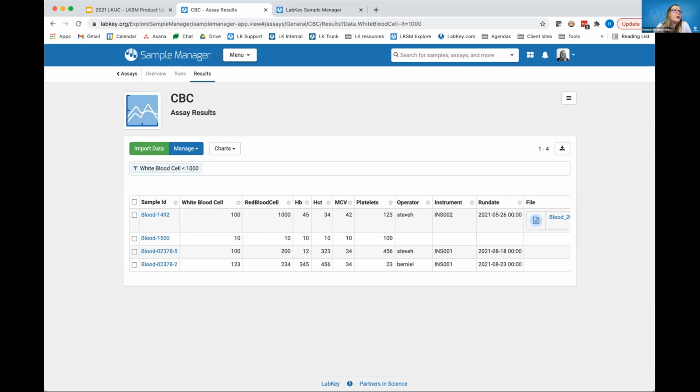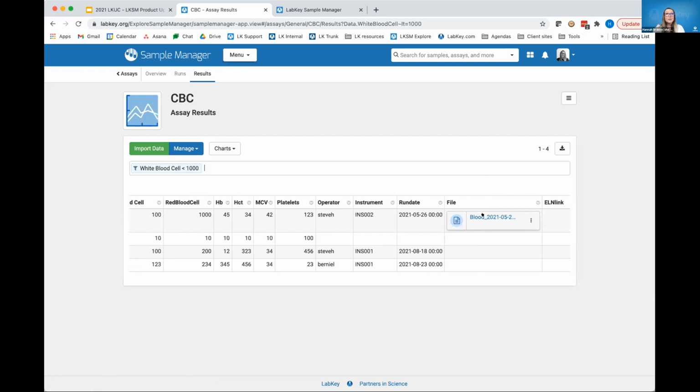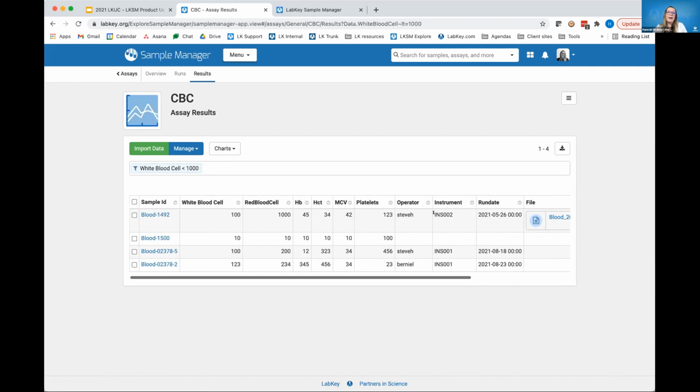And then another question here: can files other than text format be uploaded? So I think you're referring to the import of sample data or source data or assay data. And the answer is yes. We support .txt and Excel and TSV as well. If you're referring to the file that's being represented here, this is really agnostic to the type of file. We've just allowed for you to say, yep, you want to add a file and make that change.